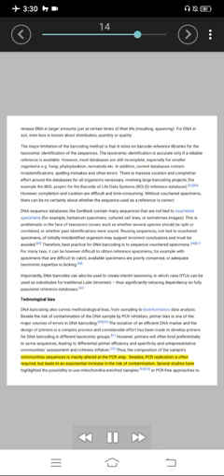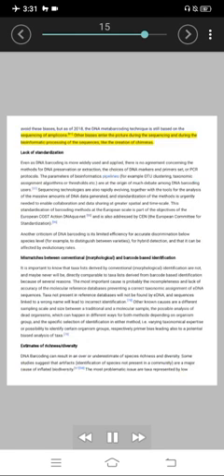Besides, PCR replication is often required, but leads to an exponential increase in the risk of contamination. Several studies have highlighted the possibility to use mitochondria-enriched samples, or PCR-free approaches to avoid these biases, but as of 2018, the DNA metabarcoding technique is still based on the sequencing of amplicons. Other biases enter the picture during the sequencing and during the bioinformatic processing of the sequences, like the creation of chimeras.